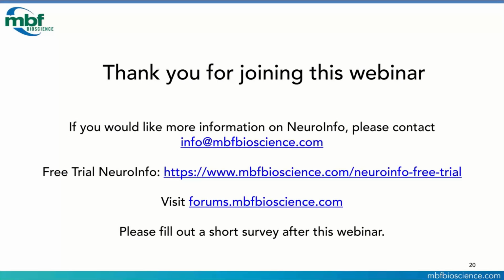And so we can do that in NeuroInfo by taking just basically the output of that, when you do the map data to Atlas, take the output file and combine them into a single file, and you can display them at the same time in that space. Or we can output that same data for people that are used to using Python or MATLAB or Fiji or other programs. You can also take that data and put it in to compare. So the answer is yes, you can take data from different animals and compare them directly.